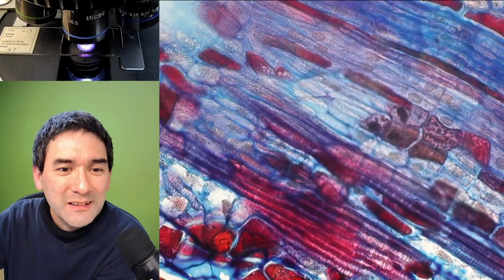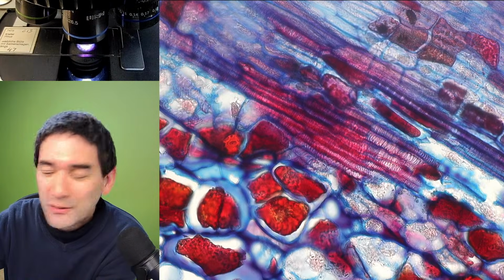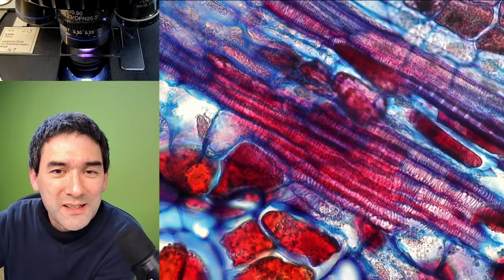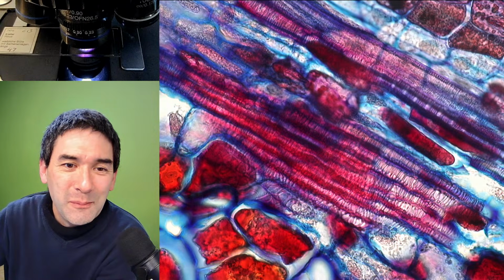Yeah. Of course, here we are again, every week. I know you're already starting to feel tired of that. What is this? Those vessels that have these ring-shaped structures in the cell wall. Again, the xylem.